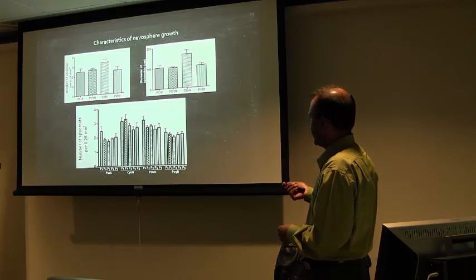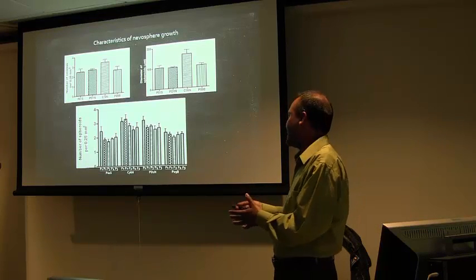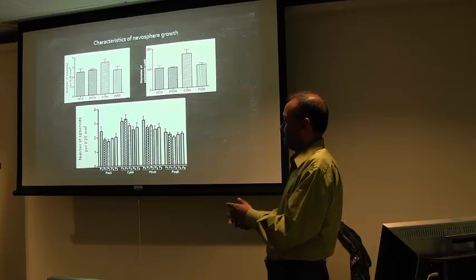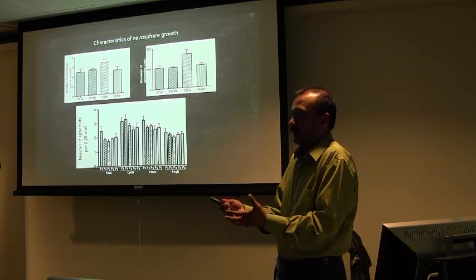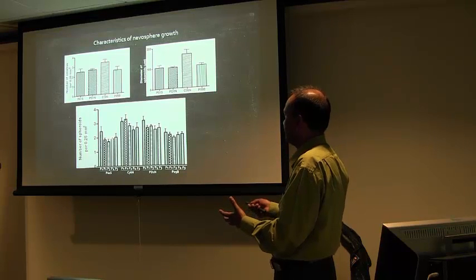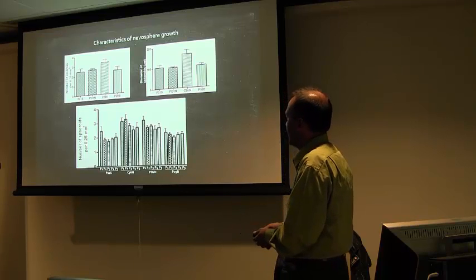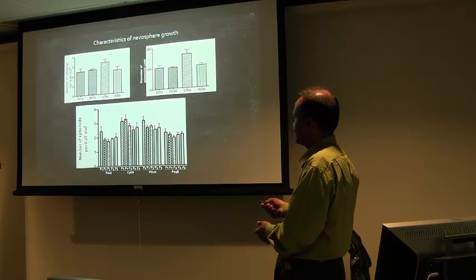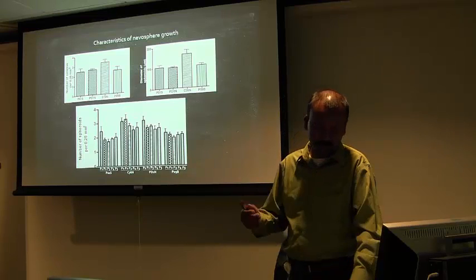And the specific good thing about this is you can actually passage them and maintain the same ability. I followed them for about 5 passages. The number of spheroids remains almost the same. So the self-renewal ability is preserved, and you can basically maintain these cells as spheroid colonies and preserve their properties. Definitely the one which has more colonies over passages showed some difference, going down a little bit, but for all others I couldn't see any significant difference.